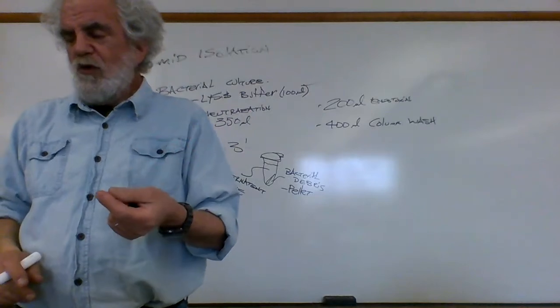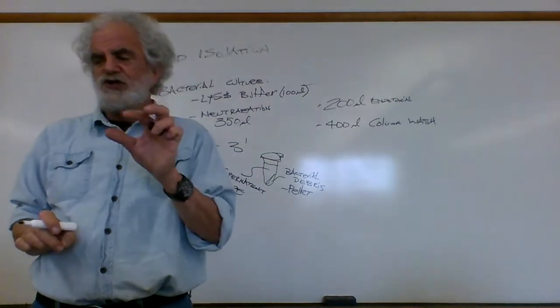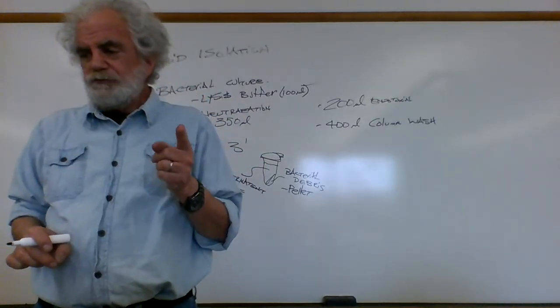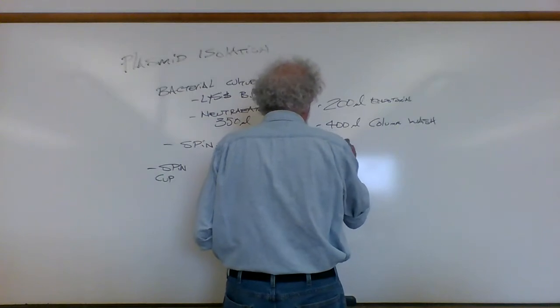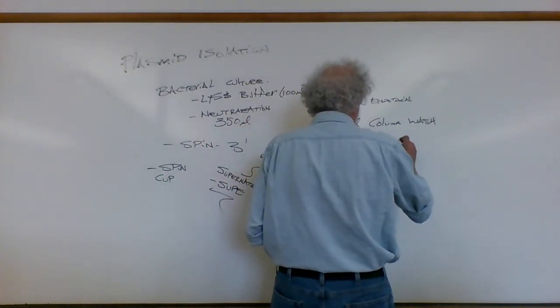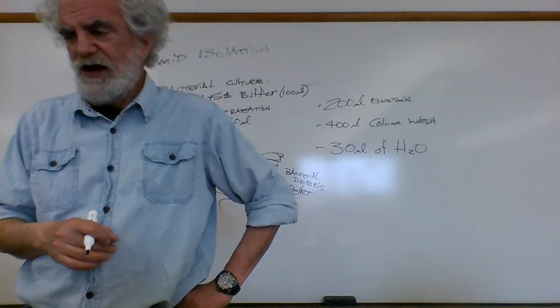So you do the column wash solution, then we'll take that little mini column and put it into a fresh 1.5 mL microcentrifuge tube. At this point, we are now ready to elute the DNA, and we do that by eluting in, they say 30 microliters, good for them, 30 microliters of pure water. They give us an elution buffer, whatever you like, it's fine.